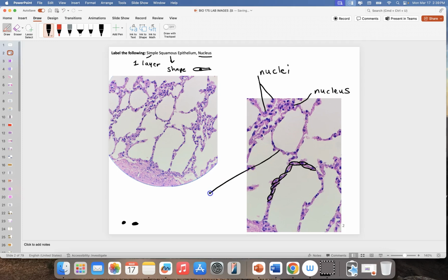I can go ahead and draw a line to those tissues right there, and then we can label that tissue off to the side.